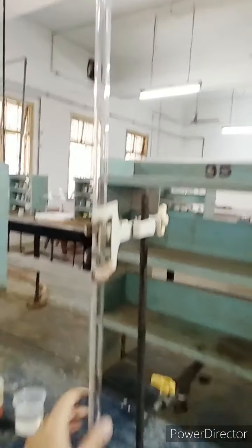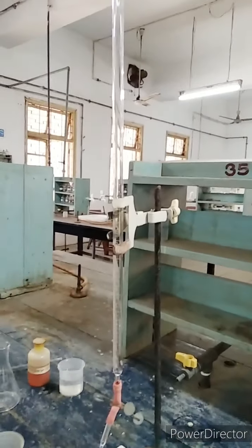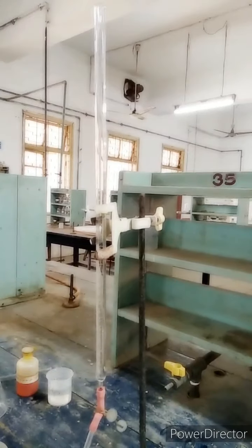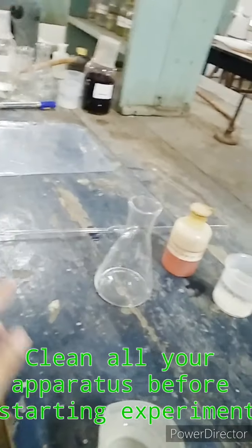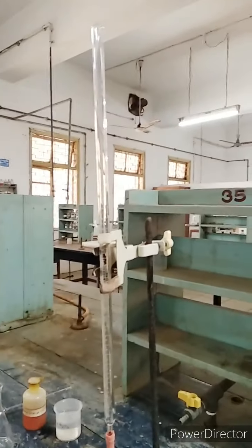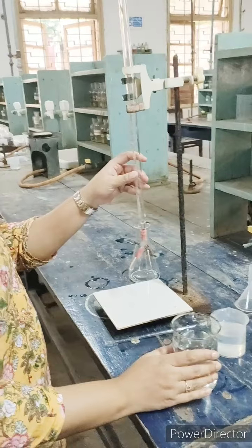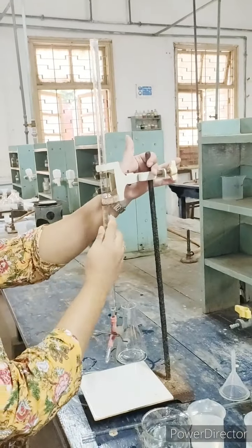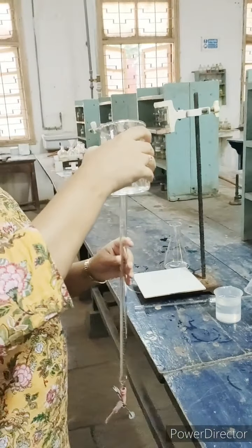Now, let's start with the experiment. Here, there is a 25 ml burette. Remember, before starting with the experiment, first of all, you have to clean all the apparatus, that is, the burette, the pipette, the conical flask and the funnel with water. You have to thoroughly rinse it with water and then with the respective solutions. Now we'll start with the rinsing of all our apparatus. We'll start rinsing the burette.